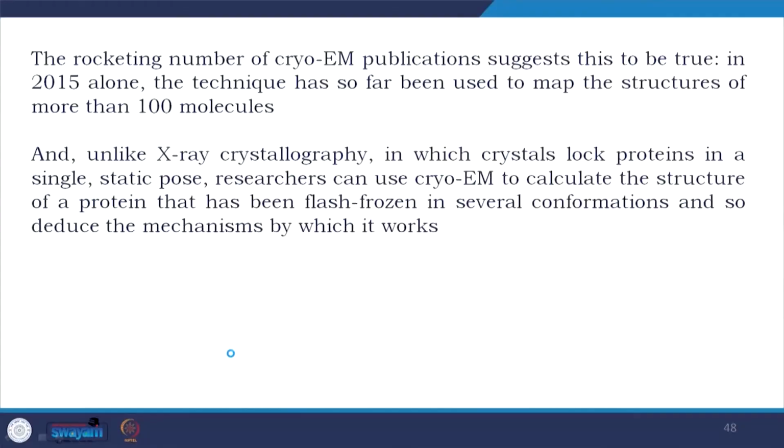And unlike X-ray crystallography, in which crystals lock proteins in a single static pose, researchers can use cryo-EM to calculate the structure of a protein that has been flash frozen in several conformations, and so deduce the mechanism of how it works. So, crystallography is definitely giving you a very high resolution structure, but cryo-EM is talking about the biology and now in the same resolution.